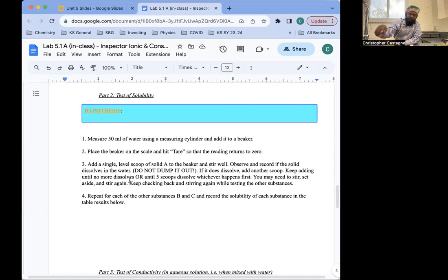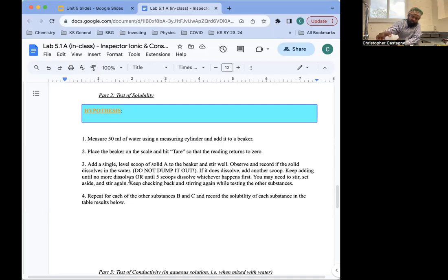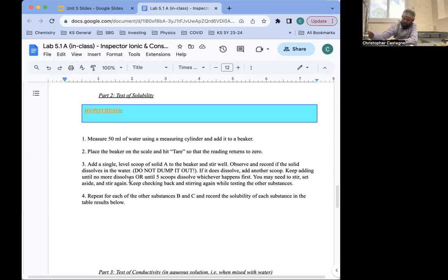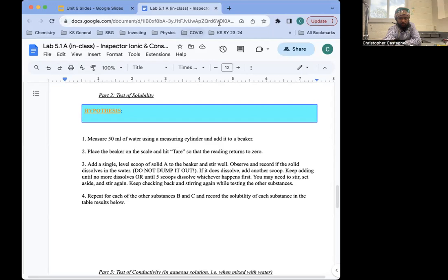This one is very simple. We measure about 50 milliliters of water — I'm not too worried about the exact measurement. I use this as an opportunity to reinforce the proper use of measuring cylinders: put the cylinder on a flat surface, get down to eye level, and measure the bottom of the meniscus. I have 25 ml cylinders trying to get 50 ml in each beaker, so that gives six opportunities to make this measurement and students get some practice.